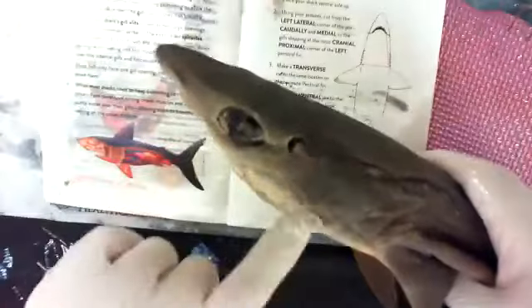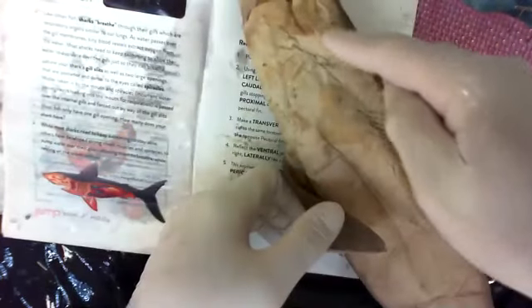Okay, let's get in there. So now let's look at the pathway. Excuse me. So how we're going to cut. This is exactly how we're going to cut. It's medical terminology. To do it properly, you can see the red dotted line just to give you a hint. But when we're cutting, we're going to cut on the left lateral side. So not medial, lateral, left side. Shark's left. The shark is your patient. It's their left. Here's my left hand. Here's the shark's left side. So we're going down the left side.